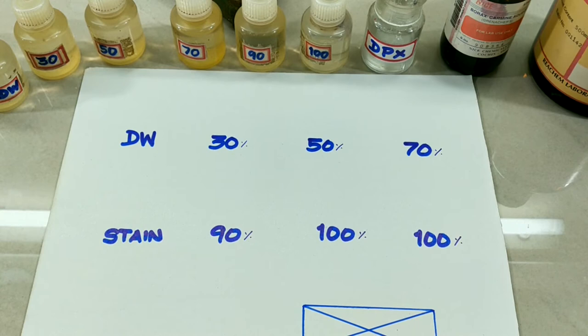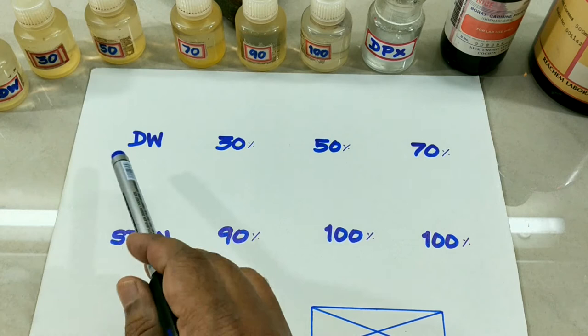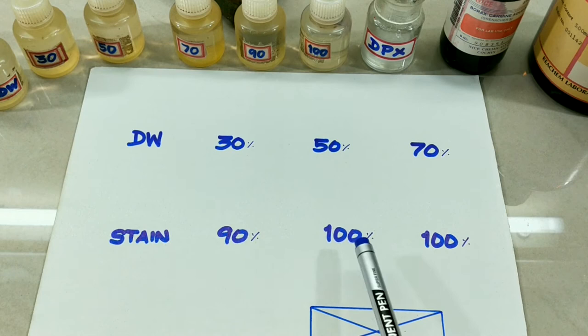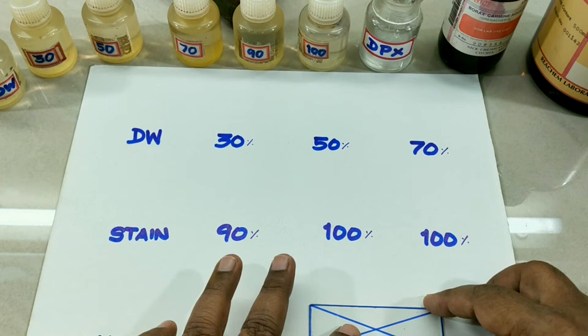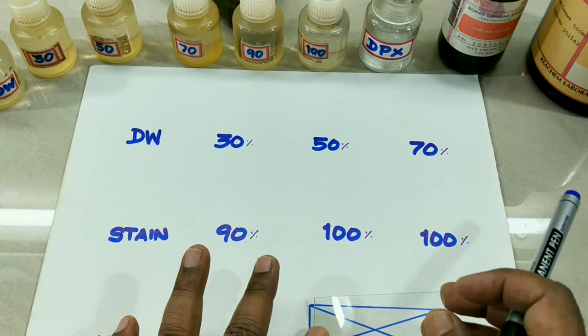We shall arrange the materials before we start. Take a cardboard or white sheet like this and write: distilled water, 30% alcohol, 50%, 70%, stain — borax carmine — 90% alcohol, 100% alcohol, and once again 100% alcohol, then xylene. Take a micro slide, keep it on the sheet, draw the margin plus cross lines to identify the center point of the slide. Keep this sheet or cardboard ready.